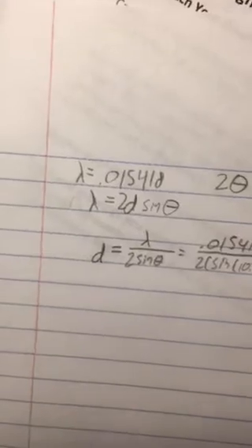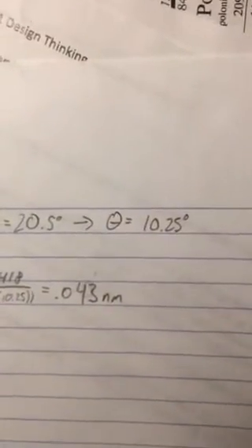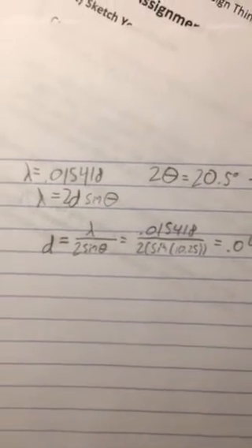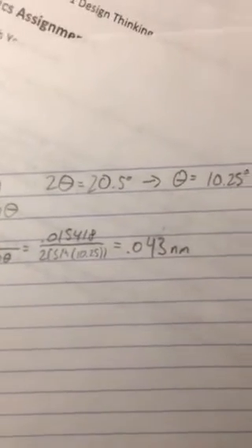In our crystal, the X-ray wavelength was 0.015418 nanometers. 2 theta was 20.5, which made theta 10.25 degrees. The formula for d-spacing is lambda equals 2d sine theta. d equals lambda over 2 sine theta, which simplifies to a d-spacing of 0.043 nanometers.